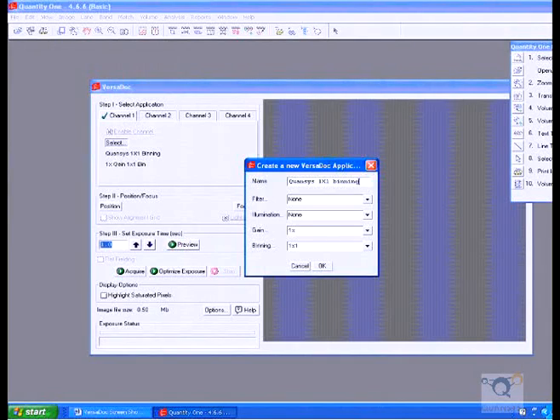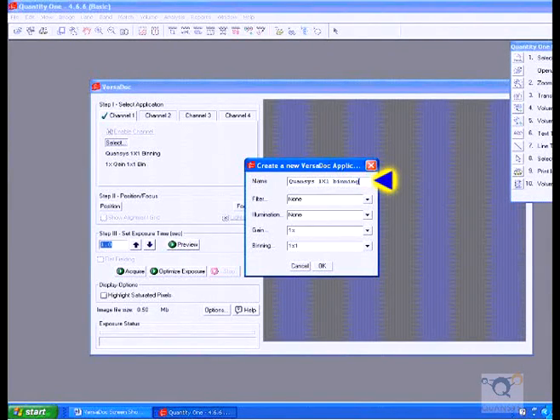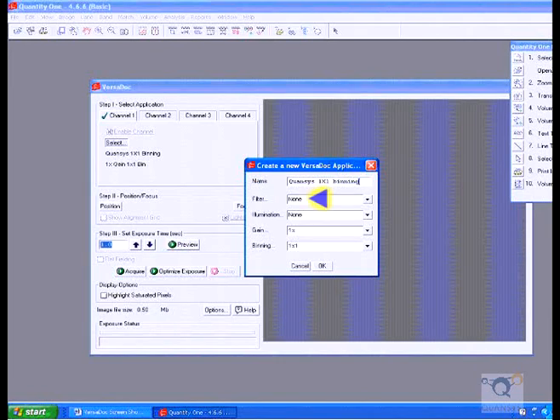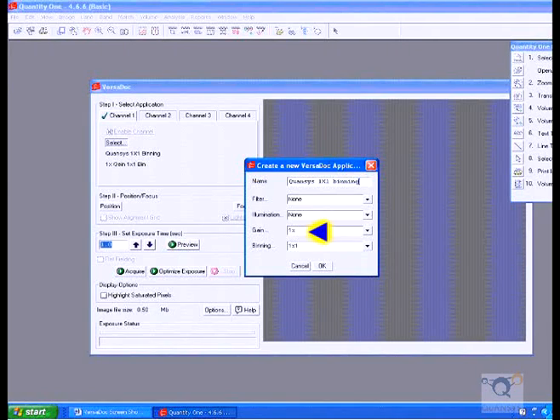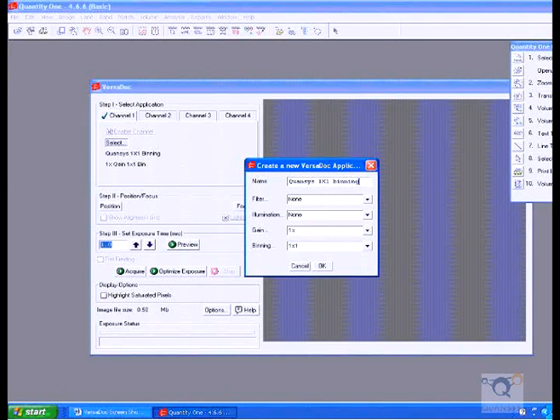When the new window opens, name this custom setup as Qwansis 1x1 Binning and change the settings to Filter: None, Illumination: None, Gain: 1x, Binning 1x1. Click on OK.